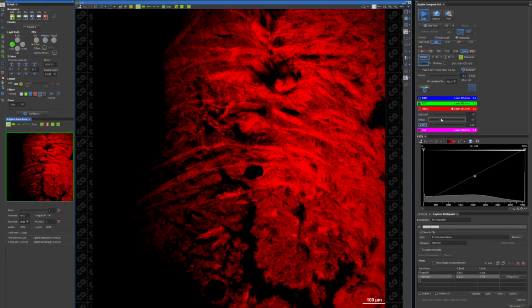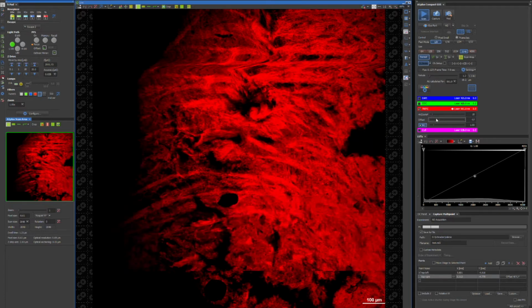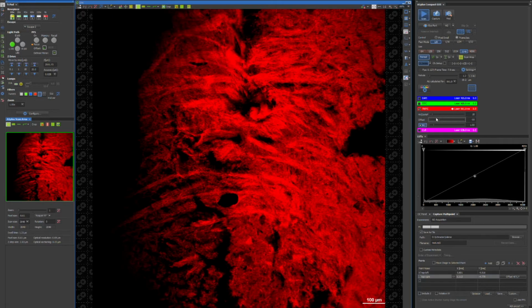which is not what I want to see. I want to visualize small dendritic projections, so seeing as the red dye has the potential to become its own project with its own set of challenges, I think I'm going to go back to the DiO for the next round because I was closer to success with that one.